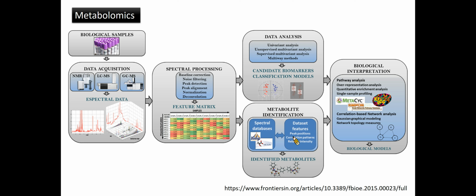Once the complete set of metabolomic features has been generated, univariate and multivariate data analysis methods can be applied to investigate the general structure of the metabolomic data in the dataset and how the different metabolic features are related to the phenotype data associated with the sample. The analysis of metabolomic data can often be used to build models that attempt to describe the observed data and to have a higher-tier biological interpretation.